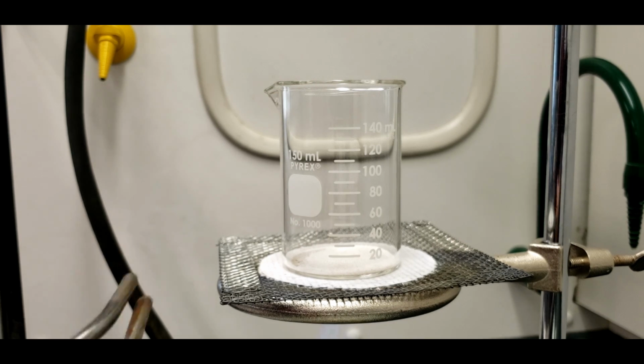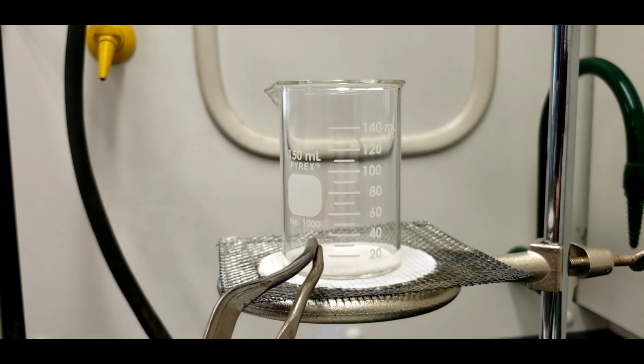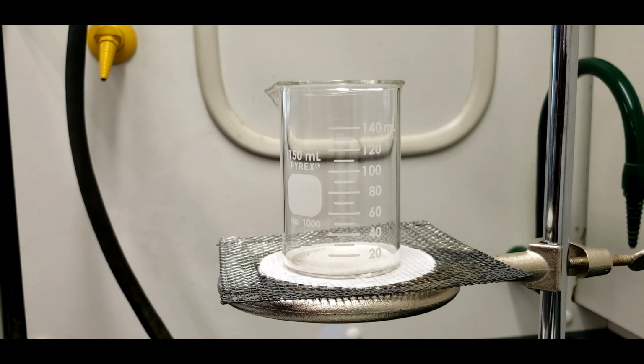We'll see. Another thing about this, I'm using this wire gauze, this wire mesh here, rather than the clay triangle, mainly because it is so unstable that I'd say about 1 in 3 students drop their beakers using the clay triangle. I do it probably 1 in 5 times. So as funny as it is to watch, it does take a lot longer to get the lab done. So that's why I have this stable thing. The positive of the clay triangle, the reason to use it, is there's nothing in the way of the flame, so the beaker can get hotter. But this works just fine.